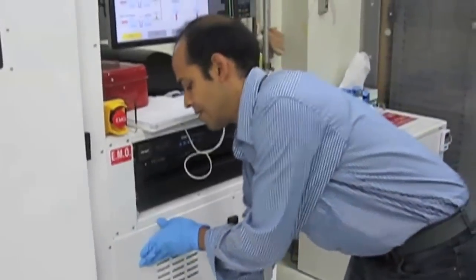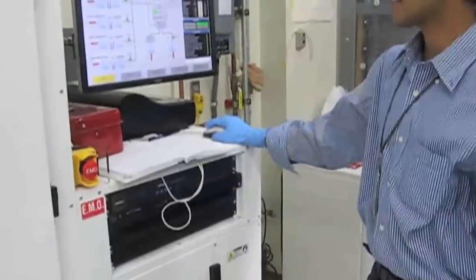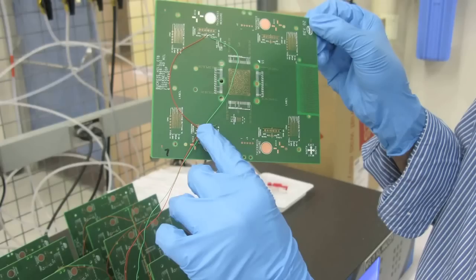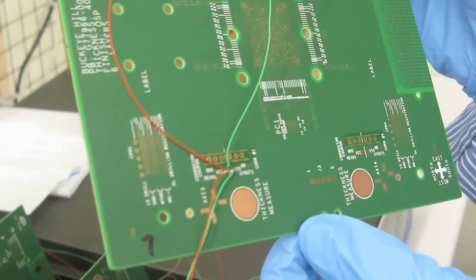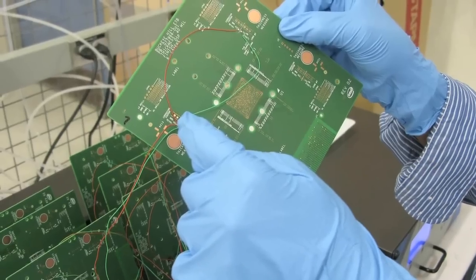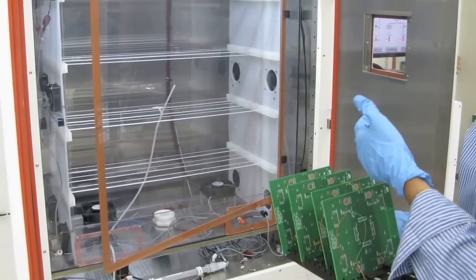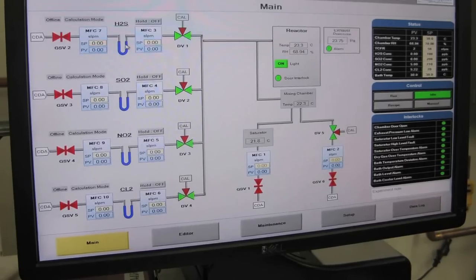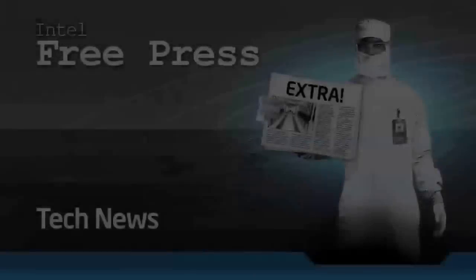Once we are done, we let the gases come in by changing these buttons over here. What you see here in this area are the black corroded pads and features. These have been subjected to a mixed flow gas environment for five days that includes gases like H2S, SO2, NO2, and Chlorine.